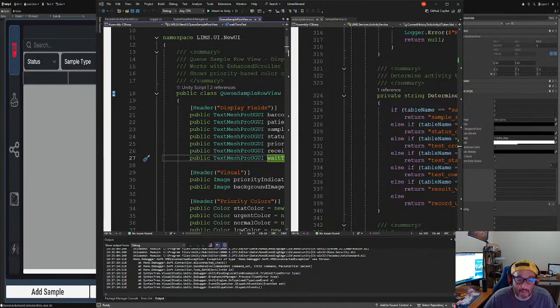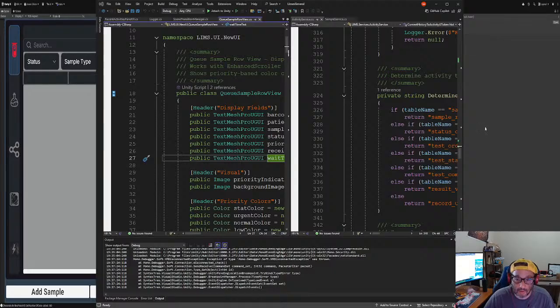Okay, so we did that with what we were doing. Okay, the cube prefab. All right, we're gonna make that into a prefab real quick. All right, so we're gonna make another one. We're gonna say Q because we want to separate that. Because if not, it'd just be full of junk.